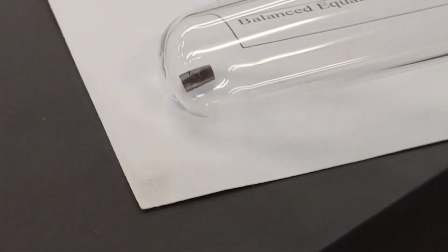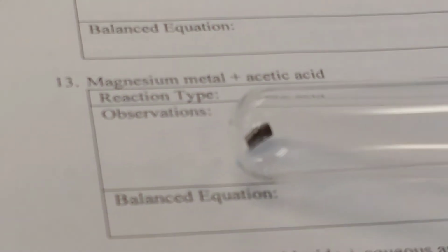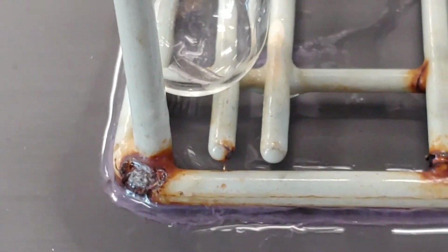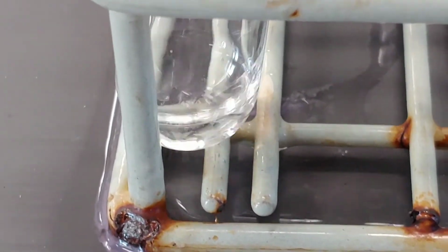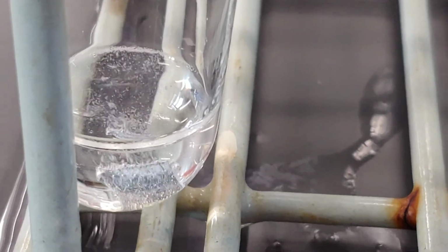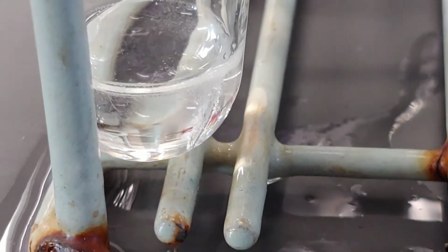Okay, here I have a strip of magnesium metal, and to that, reaction number 13, I'm going to add acetic acid. So there's the metal in the test tube. We'll stick that in the rack. All right, and then I'll add the acetic acid and we'll see what we get. Woohoo! It's doing something.